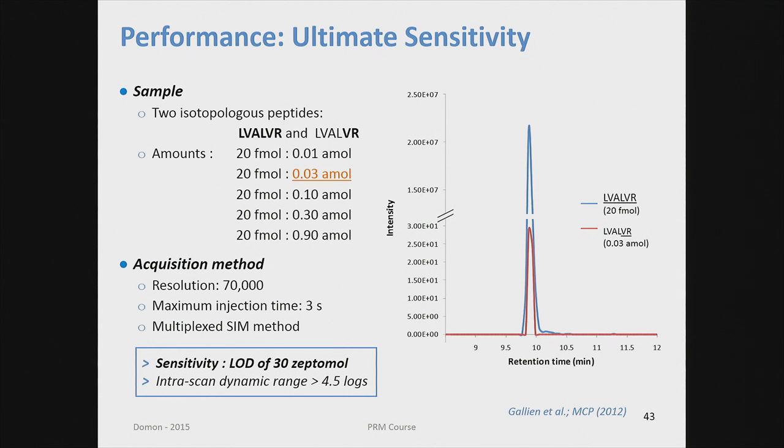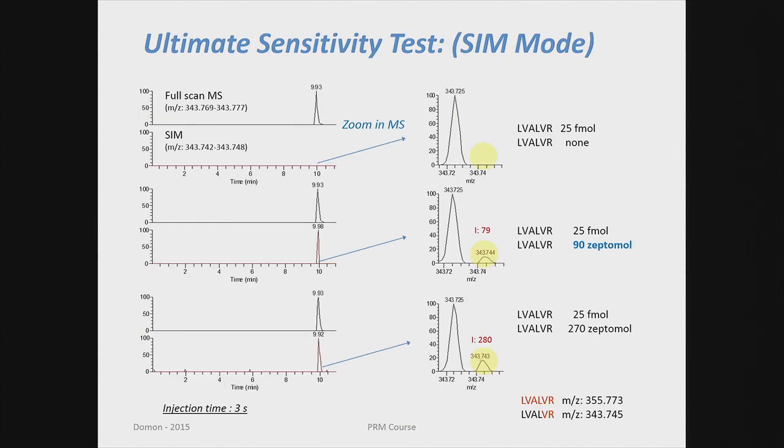But if your experiment is really geared to get a few peptides in very, very low amount, you can tune and design your experiment in such a way and use a trapping device to improve your sensitivity. And these are the raw data used for that experiment.